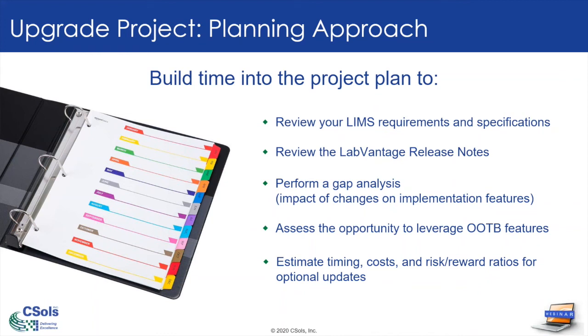Which features are you using that have been affected by upgrades between all the versions that you're going from and to? Take a look at the out-of-the-box features that have been improved or that are new that you may be able to leverage and going down the road improve your LIMS, perhaps moving even away from where you customized a solution and LabVantage have now built that solution into the product. You might want to migrate what you're doing into the out-of-the-box solution so that it's more fully supported going down the road, and you get all the free bug fixes and upgrades that come into that solution.